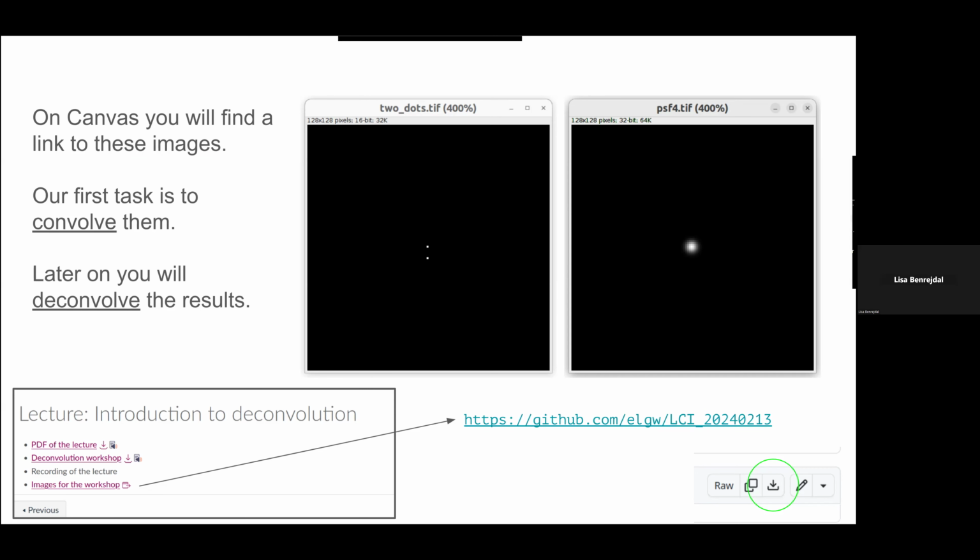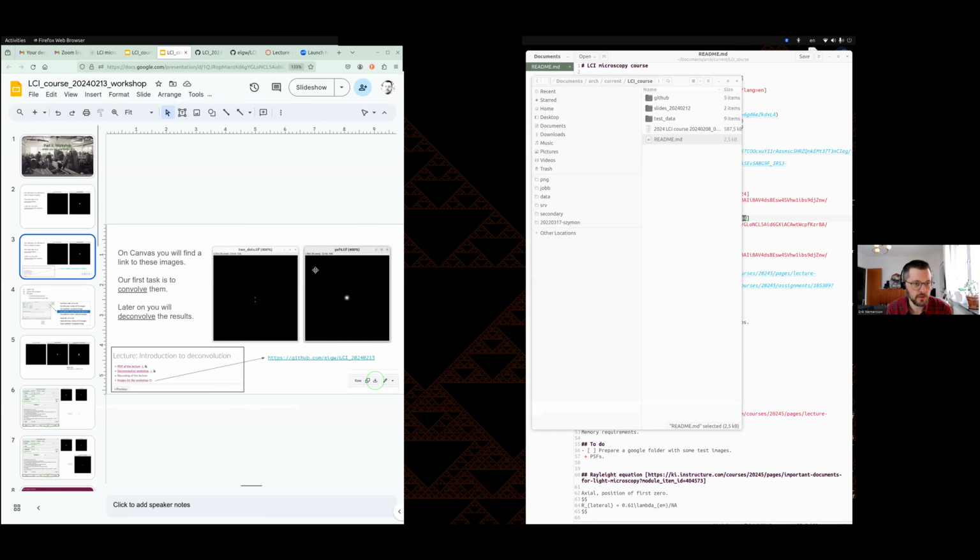I don't know if it's just me, but I don't see the download button. If you click on the name of the file, you go to a different page, and on the right side you have a little arrow pointing down. I don't have the arrow. Okay, what I will do anyway is put the 4 images, or maybe it's possible to share them here in the chat.